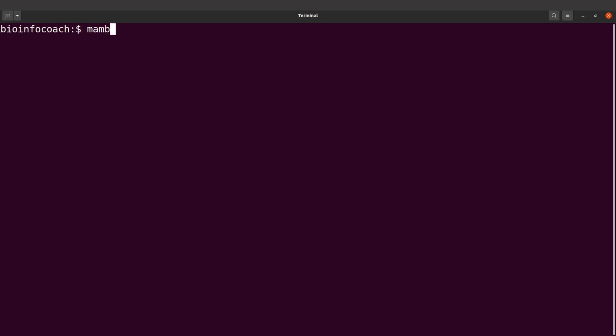So I'll say mamba create -n, and then I'll say busco. This is the name of the environment. Now let's also install BUSCO. So I'll say busco. So this is it.